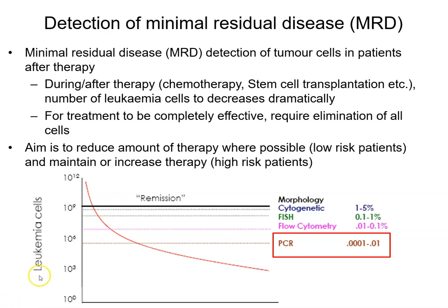So we're going to have to understand polymerase chain reaction to understand how this works. If you've not already done it, what you should now do is pause the video and go and look at that polymerase chain reaction tutorial to understand how PCR works, and then from that point on we will explain how what we call translocation spanning PCR can work.